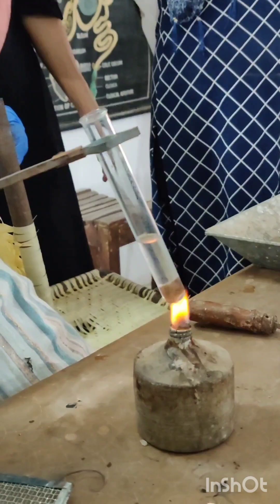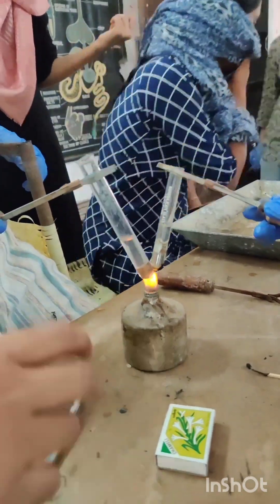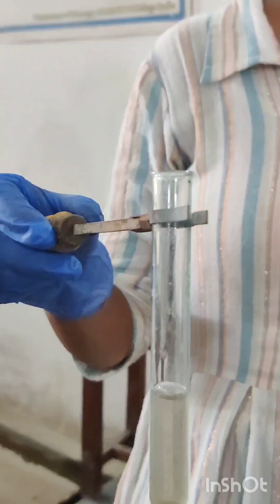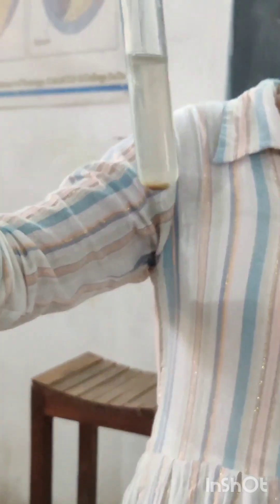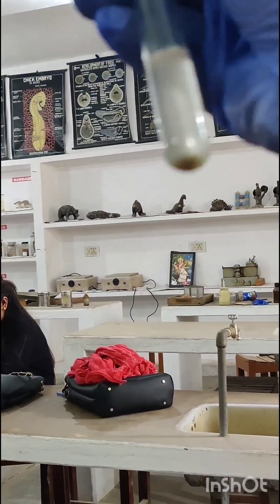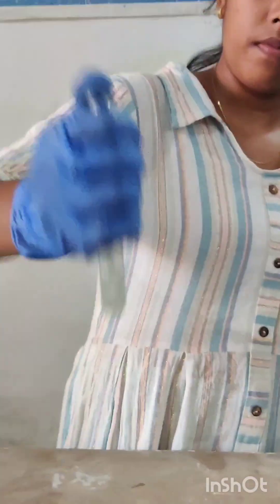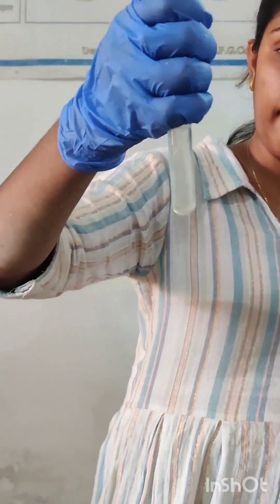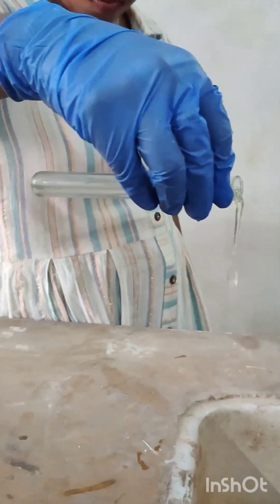Then put it into a test tube and add 10% KOH solution and heat it until the solution is fully mixed. Drain out all the solution, stir it, and allow it to cool. Then add water and rinse off all the KOH solution.